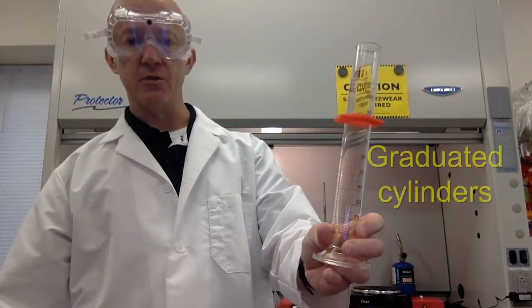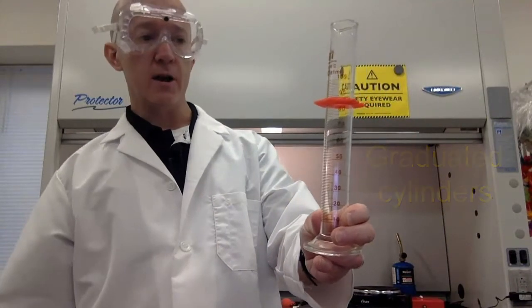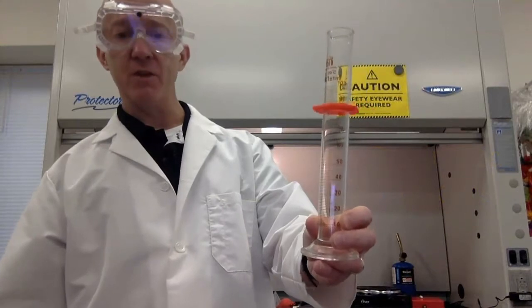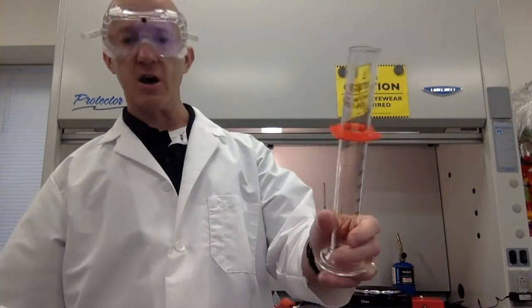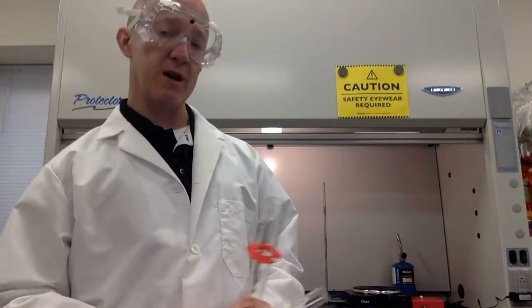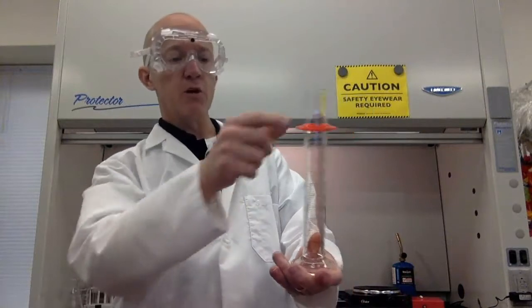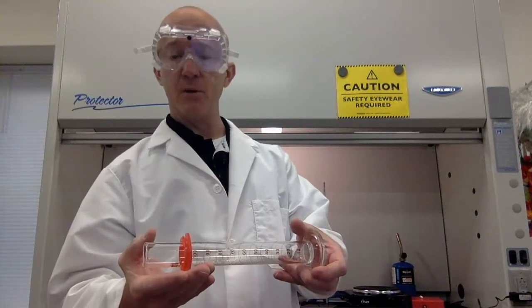These are called graduated cylinders. Graduated because you'll notice the lines all the way up. They give very accurate measurements of volumes. You have them in varying sizes. This one has a 100 milliliter capacity. This one has a 50. There are smaller ones. We have 25s and 10s. If you're wondering about this plastic ring right here, that's to help the graduated cylinder from breaking if it happens to tip over.